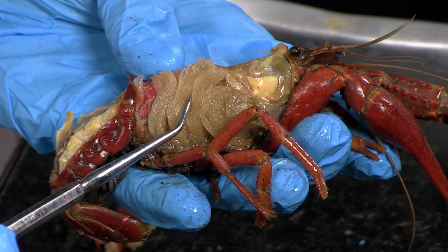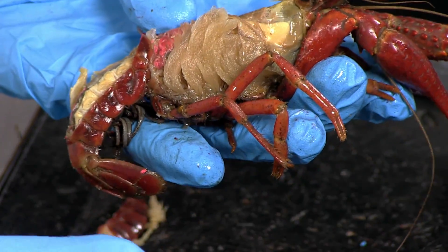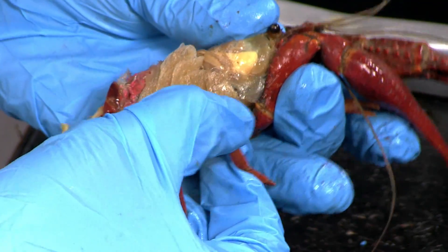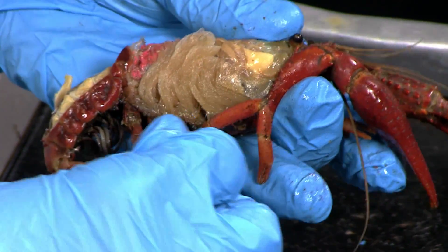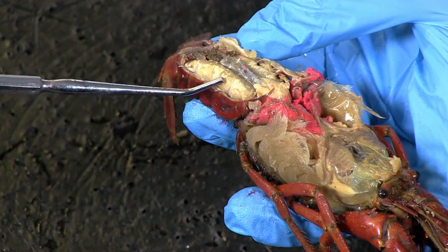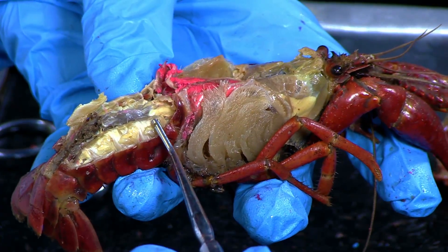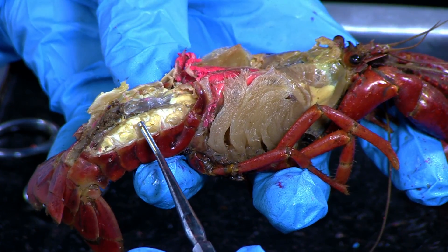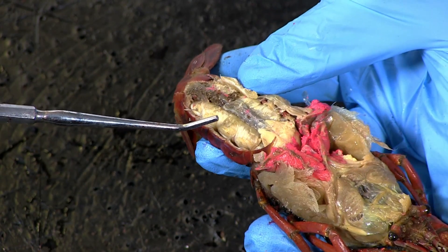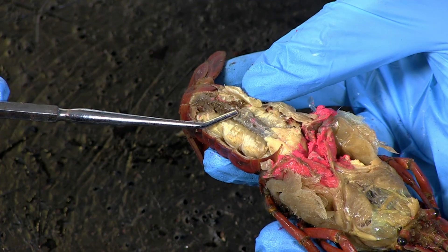Once the carapace is removed, locate and observe the gills. Take a picture of the gills. Move the walking legs and notice how they are attached to the gills. This helps with respiration and serves to move water across the gills. Observe that there are lots of abdominal flexor muscles that can be viewed on the dorsal side flanking the intestine. Take a picture and label the abdominal flexor muscle. In between this muscle is the intestine, a long tube that runs along the abdomen to the stomach. Take a picture and label the intestine.